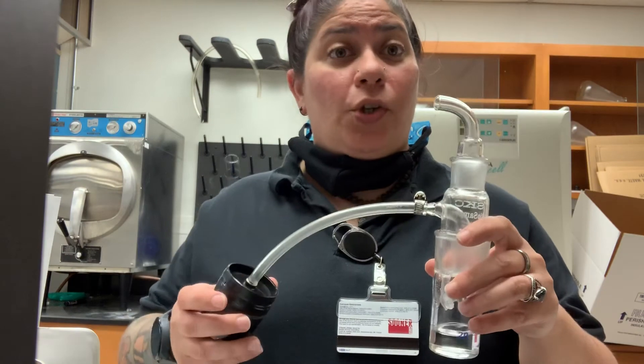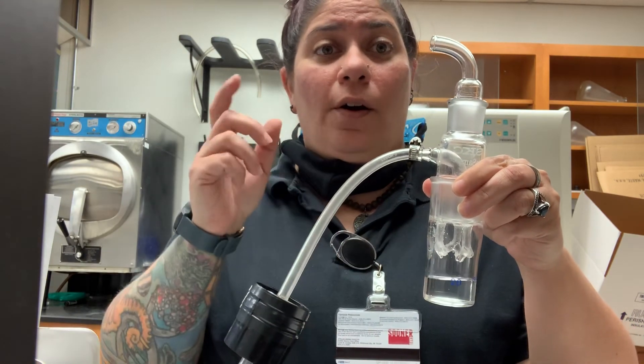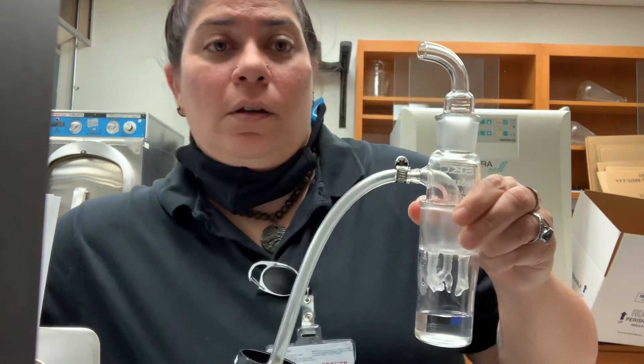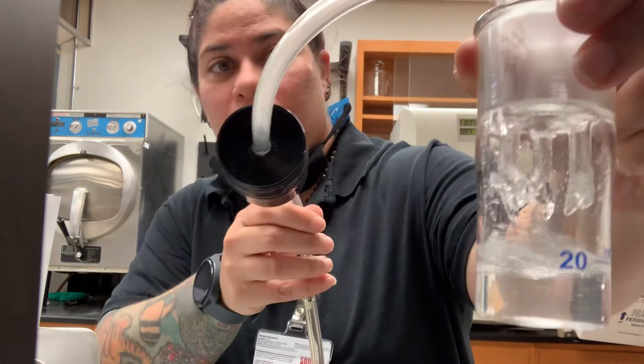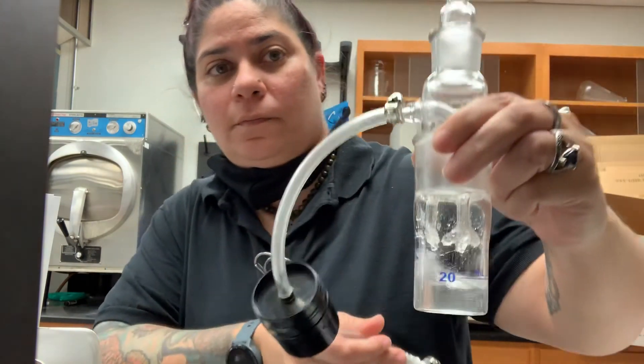And this is our sample train. At this point I'm going to go ahead and turn the pump on — it may get a little loud — so you can see the action of the aerosol collection through the sampler. And that's it for the biosampler.